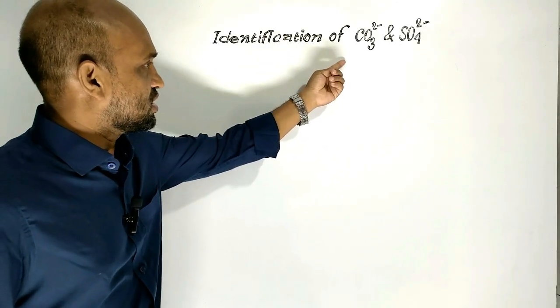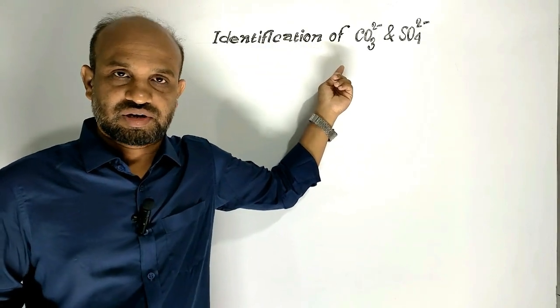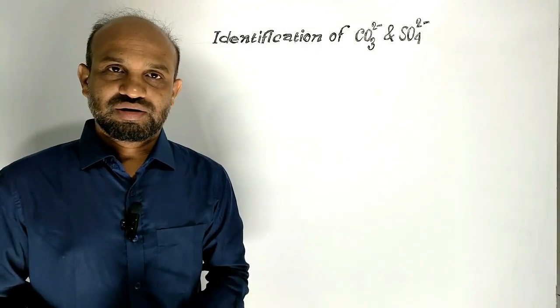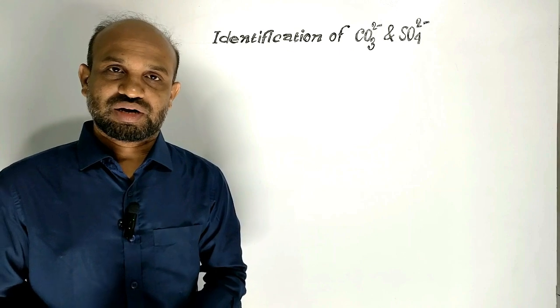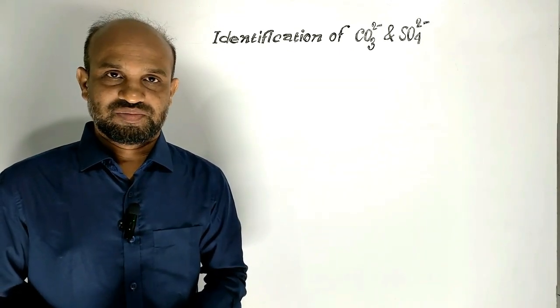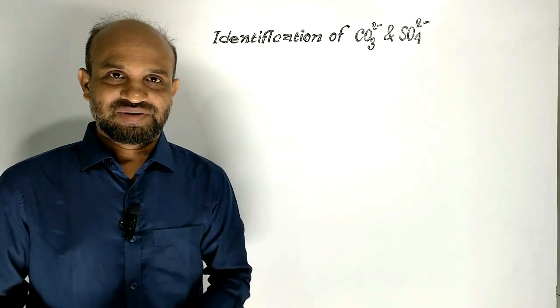Identification of carbonate ion and sulfate ion. This is today's lesson. In this lesson, we are going to learn how to identify carbonate ion and sulfate ion and how to distinguish them. So let's begin.